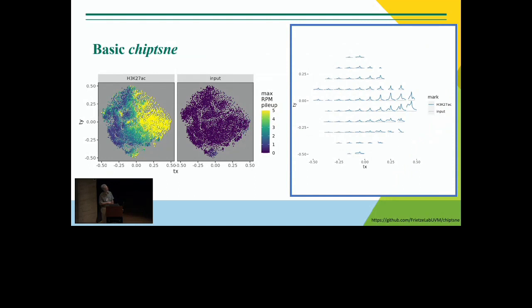So this is the same kind of view that I showed as kind of a teaser. And what this view is really doing is we've divided this t-SNE space up into 10 bins going across and 10 bins up and down, and we're just averaging the profiles in that space and representing them here. Yeah, we see subtle differences here, I'd say, in peak shape. There's double peaks here. That might be interesting to investigate. And so this is really the starting point of ChIP t-SNE analysis.